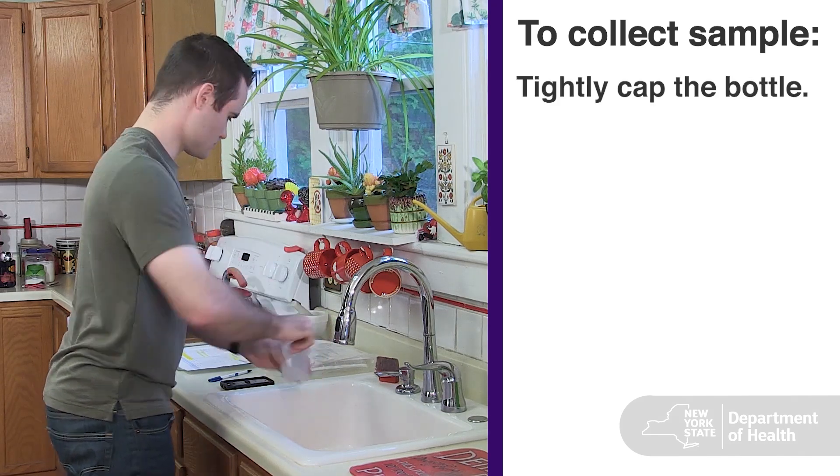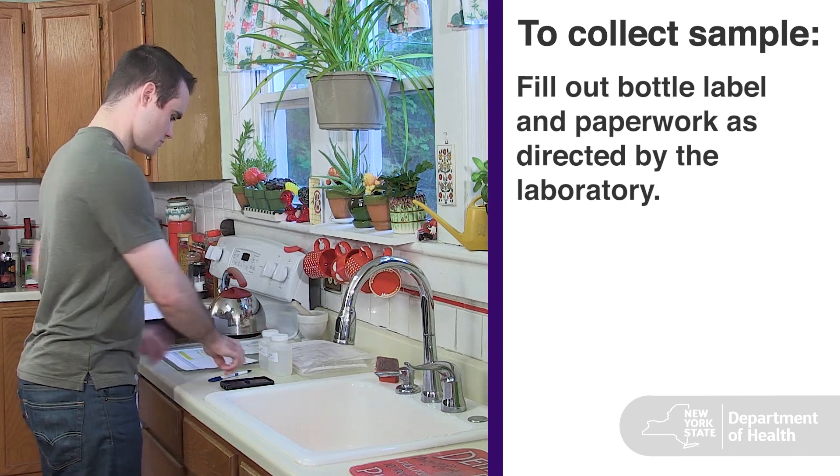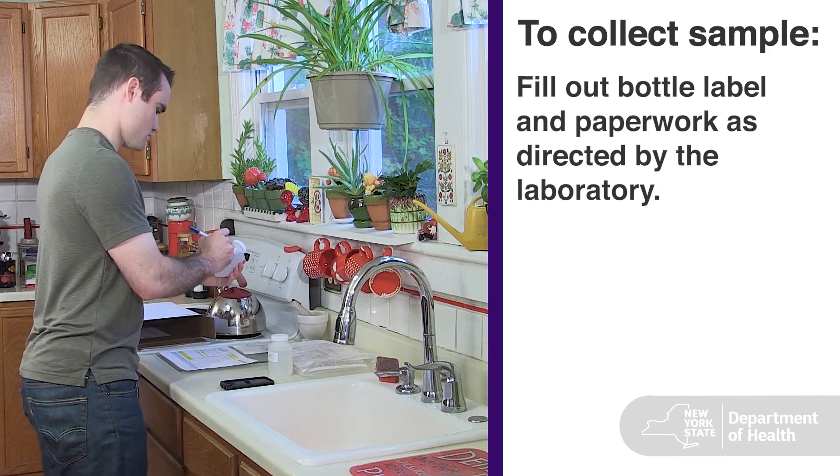Tightly cap the bottle. If there is a label on the bottle, fill it out as directed by the lab.